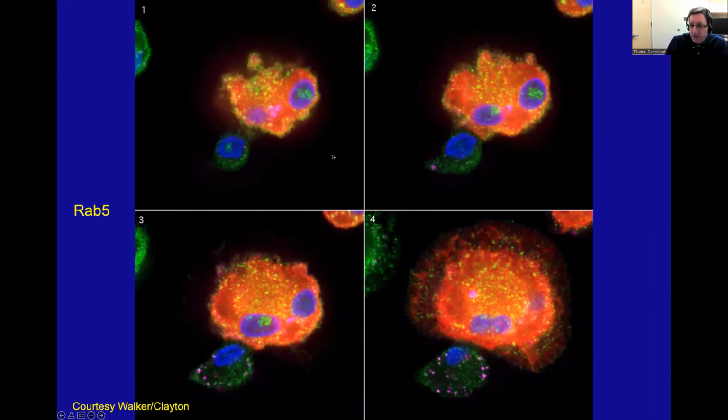And so we were able to create these composites or projections of the cells from the Z-stacks, and also look for events such as this, where there's one large red cell engulfing a smaller cell. Depending on the strain of HIV, you will get these macrophages forming these very large multinucleated monster alien cells. So it's quite unusual. We had to be selective in terms of the strain of virus we were using, because sometimes these cells would just be so huge. I mean, they would have like 20 nuclei, and they weren't really the kind of cells we were interested in.